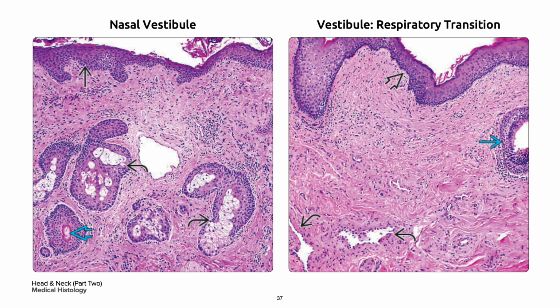On your left is the nasal vestibule, which is lined by skin with stratified squamous epithelium in a single black arrow. It contains all the layers of the normal epidermis. There are numerous hairs in a bold blue arrow with associated sebaceous glands in a curved black arrow. The coarse hairs and secretions act to trap your inhaled particulate matter.